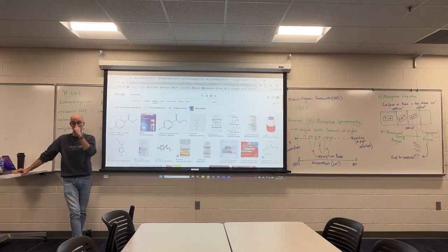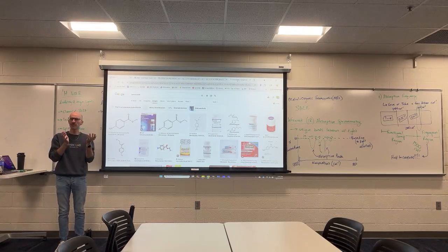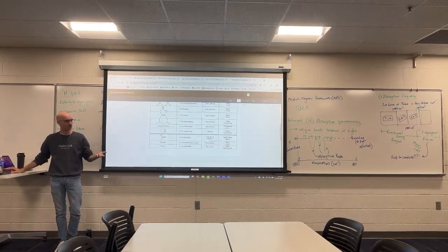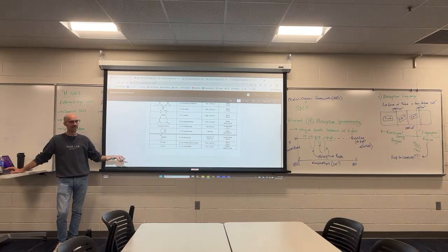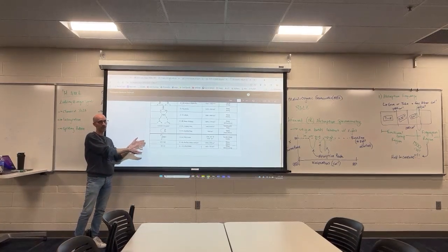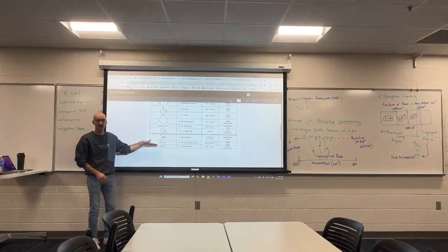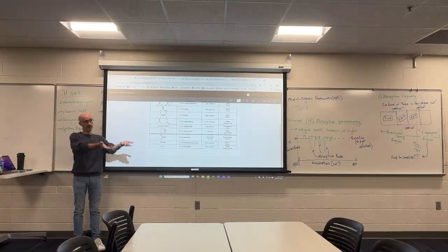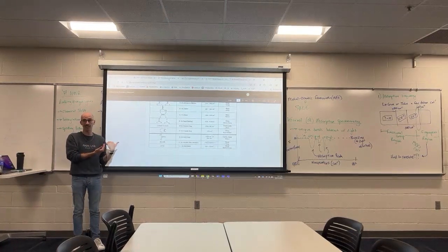So a better answer in their report would have been to say, confusingly, benzocaine has no halogens, no alkyl halide compound of any type has been used during this synthesis in any way, and yet there are still signals that correspond to a CX bond. And the answer is, it was something else causing that absorption. But that was the confusion about my limited correlation table. Because my correlation table doesn't say also a bunch of other bonds absorbed down here, they were left to assume those signals at the bottom of my spectrum must correlate to something on this table.